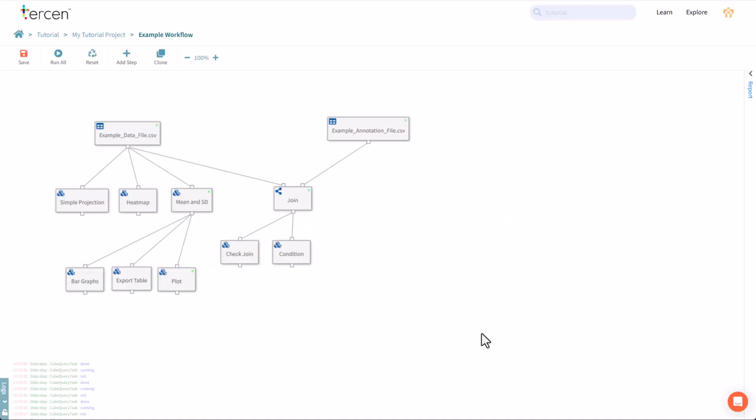Until this point, we've used a file with a single main measurement called value. But what if a file has more than one main measurement? It is possible to convert the format of the data to allow this. This involves changing your data from wide format to long format.